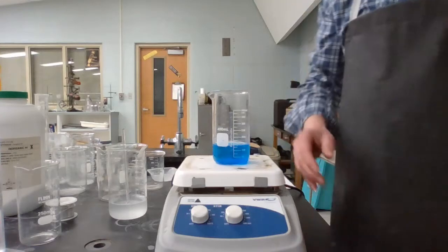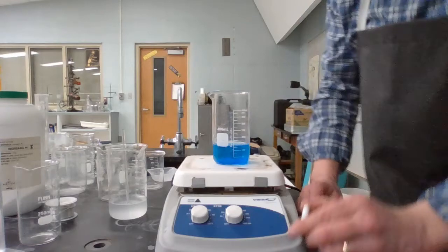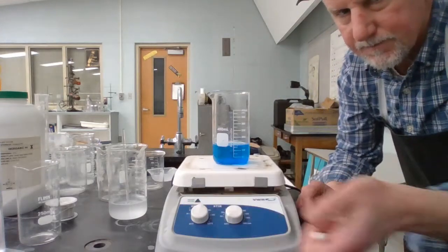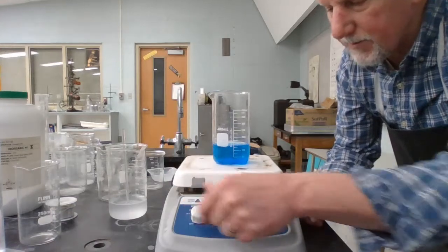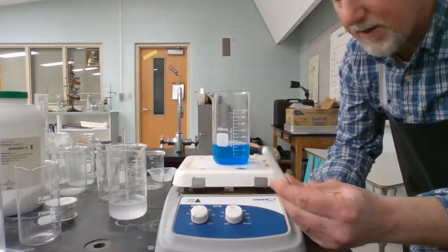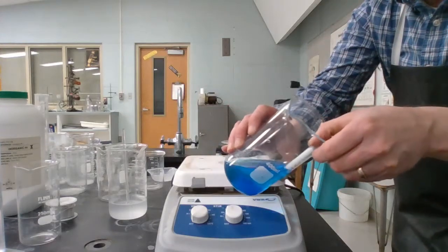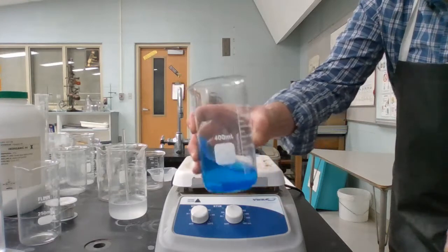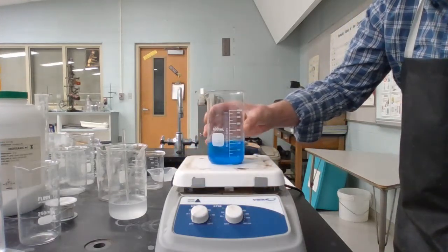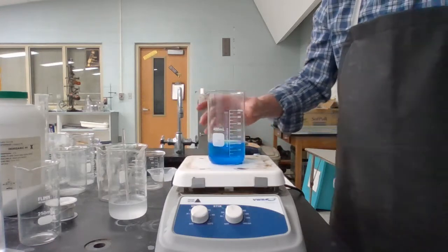So we'll do these reactions on a hot plate. The nice thing is it has this function besides heating. Turn on the heat, but we can also turn on the stirrer. What that takes is a little stirring bar. It's a little magnet. So we slide this in there. Still trying to get my copper sulfate to all dissolve, so I thought I'd use this. Then there's a magnet inside that stirs it, and so we'll just let that stir.